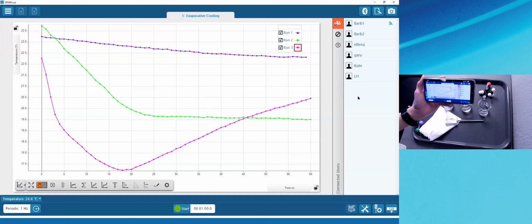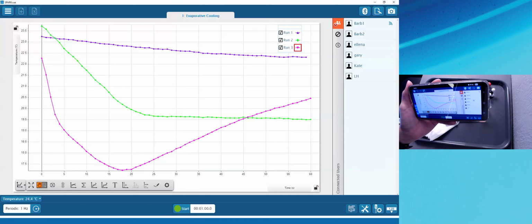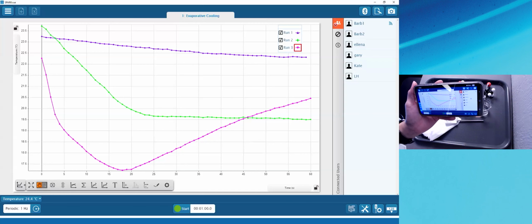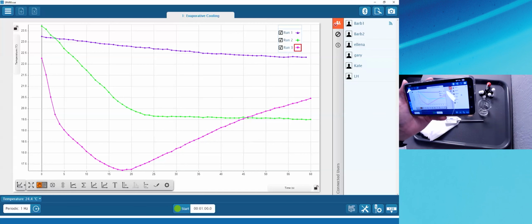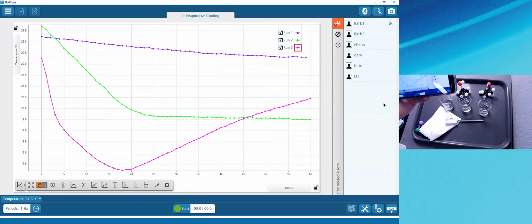And what do you see on your screen? You see my screen on your screen, don't you? Even though you're not here at PASCO headquarters in Roseville, you've got this data that I have already collected. Cool, right? If there are any more users out there, please pop in now because I'm going to switch my focus to doing the analysis.